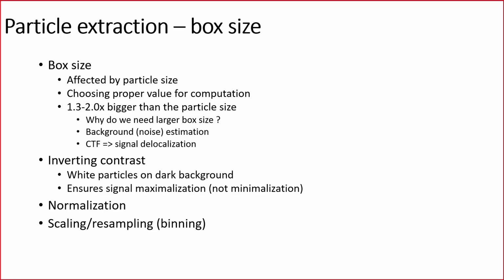We also need to normalize our particles. We will talk about it a little bit later. And optionally, we can scale or resample the particles to speed up the computational process.